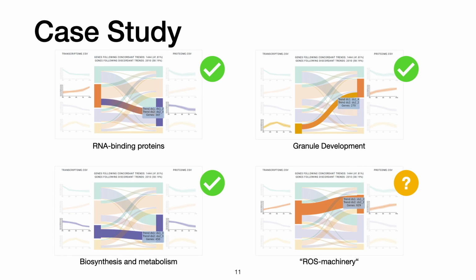For example, we could play with higher numbers of k. But all in all, we're coming to the same or similar conclusions as the authors, but our approach is much easier and much more automated, while the authors had to produce the results with a lot of manual analyses.